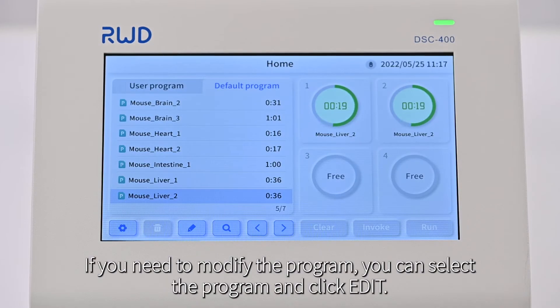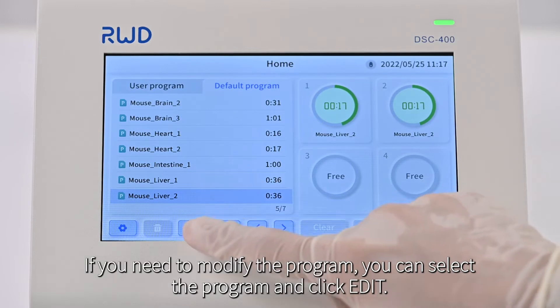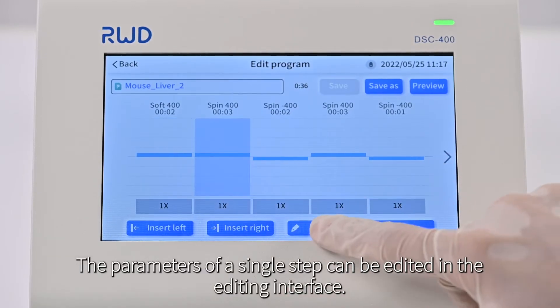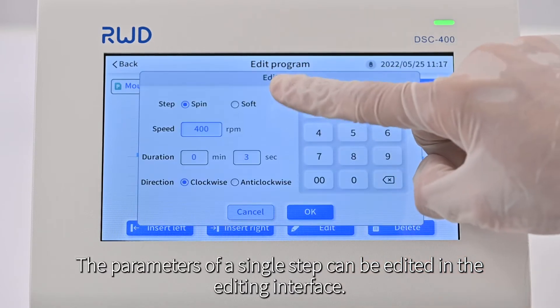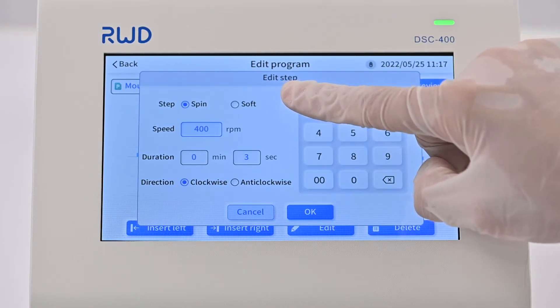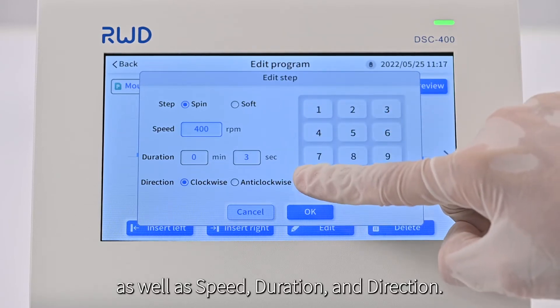If you need to modify the program, you can select the program and click edit. The parameters of a single step can be edited in the editing interface. You can set the step type to spin or soft, as well as speed, duration, and direction.